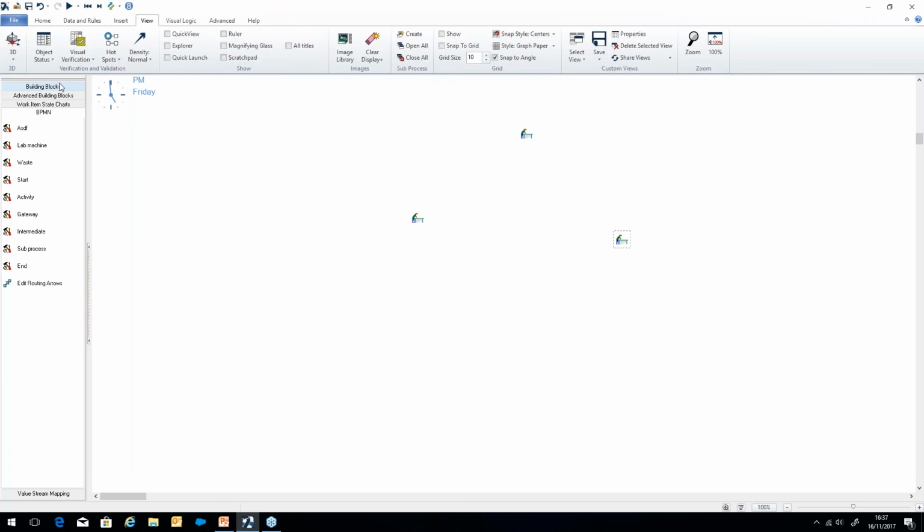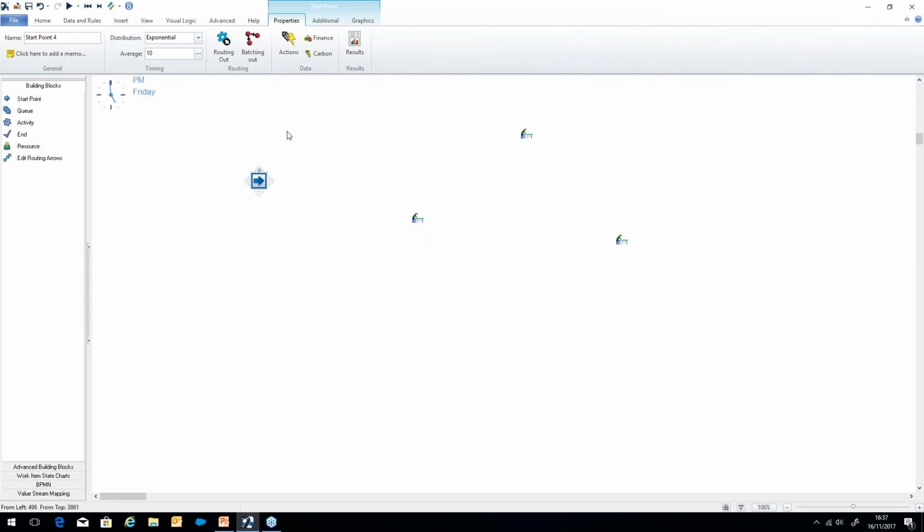So within any simulation, we want to account for the variation that happens in a real system. Hopefully you can still see this screen. Now there's lots of different distributions within the software that are built in, and don't quote me on this, but I think there are 14. So if we use some of them, like a fixed one, then that's going to show that there is going to be no variation. Now that we know that doesn't really reflect reality at all.